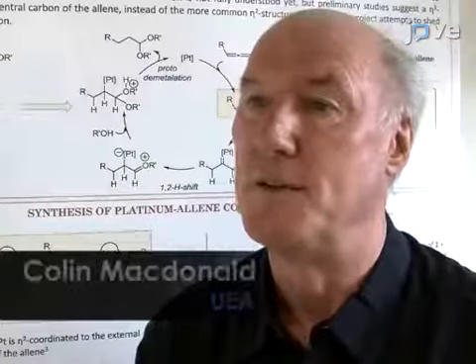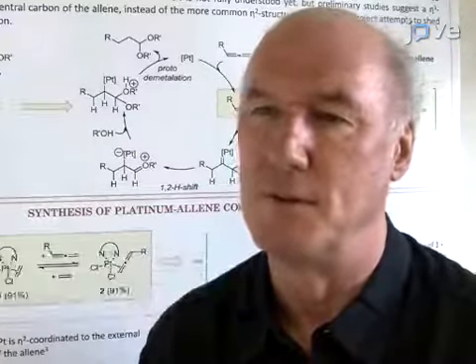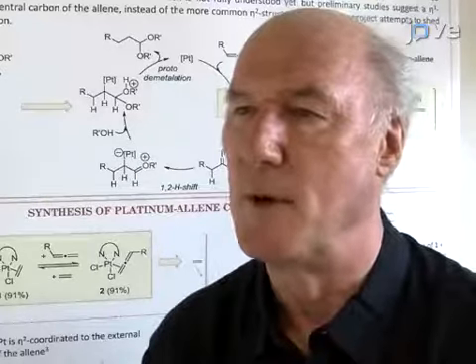The main advantages of this technique are that there is no need to reach coalescence of the exchanging signals and that the rate constant and relaxation time are obtained in the same experiment.